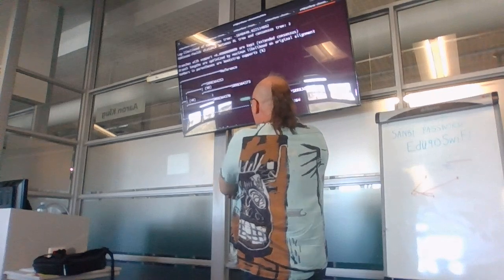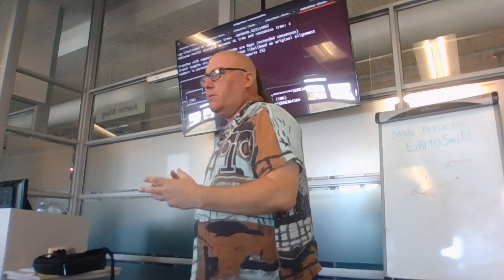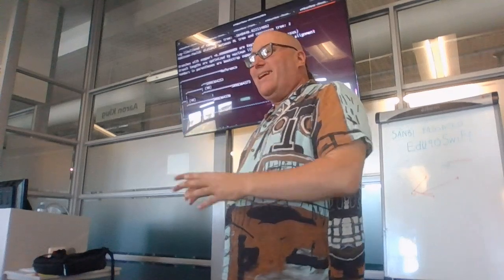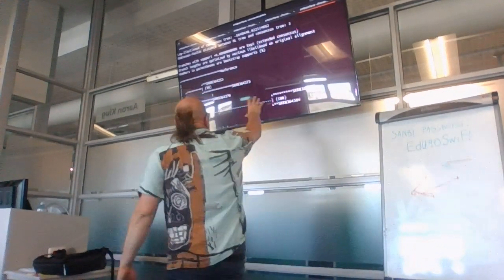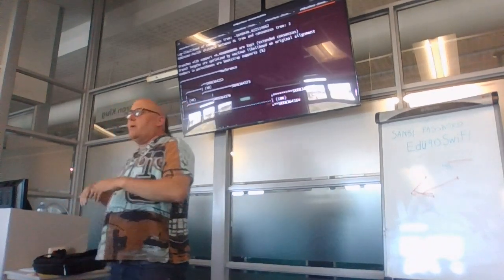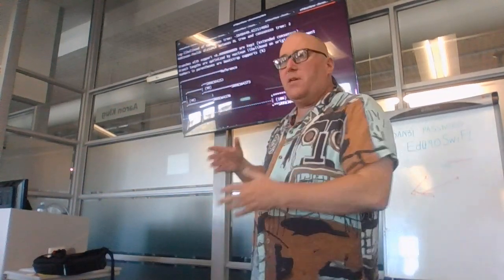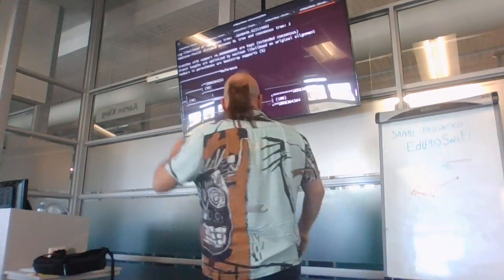And what we can see here is just a grouping, right? Because we haven't included time into the equation, but we can see a grouping and the emergence of clades. Okay? And remember, the thing with phylogenetics is that it is about ruling out, not ruling in, because there's always missing data. There's always missing in-between data.